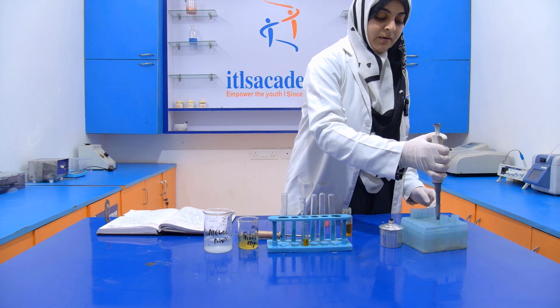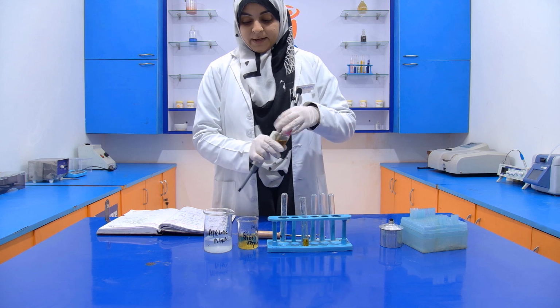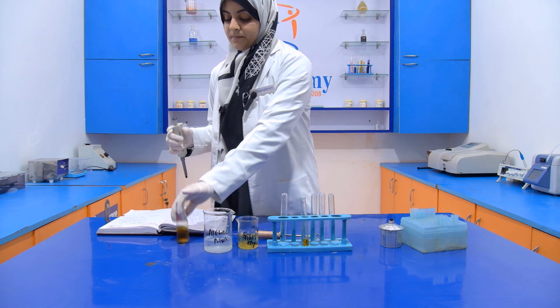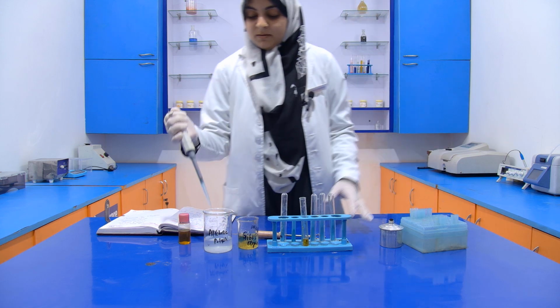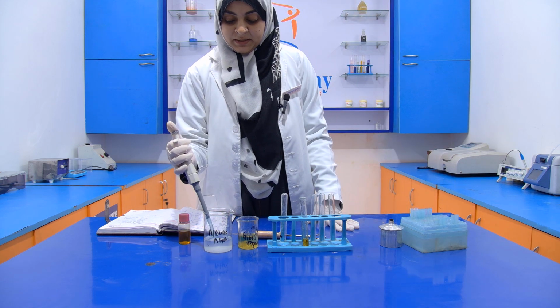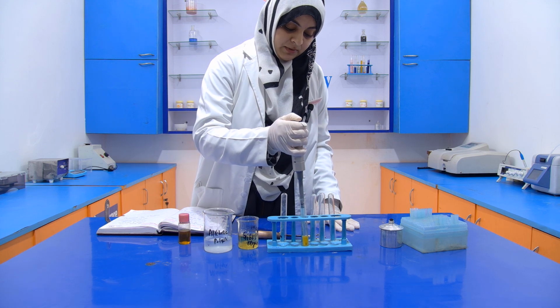Then after that, we have to add the alcoholic potash into it. Take 1 ml alcoholic potash and add into it.